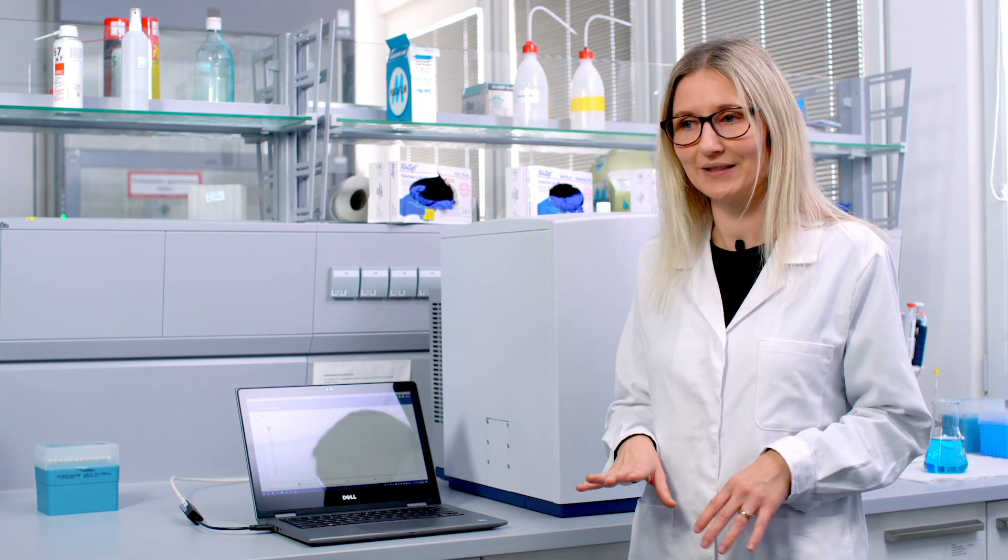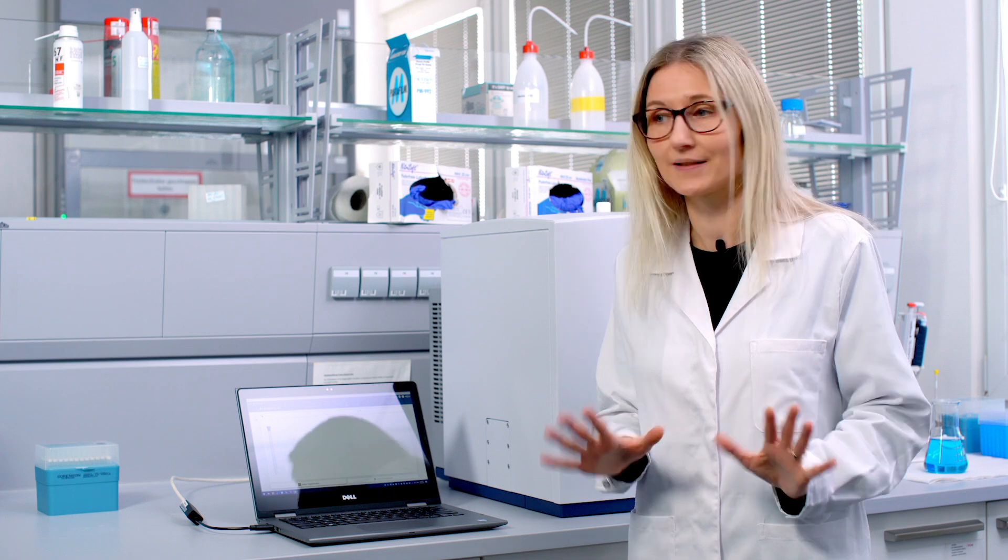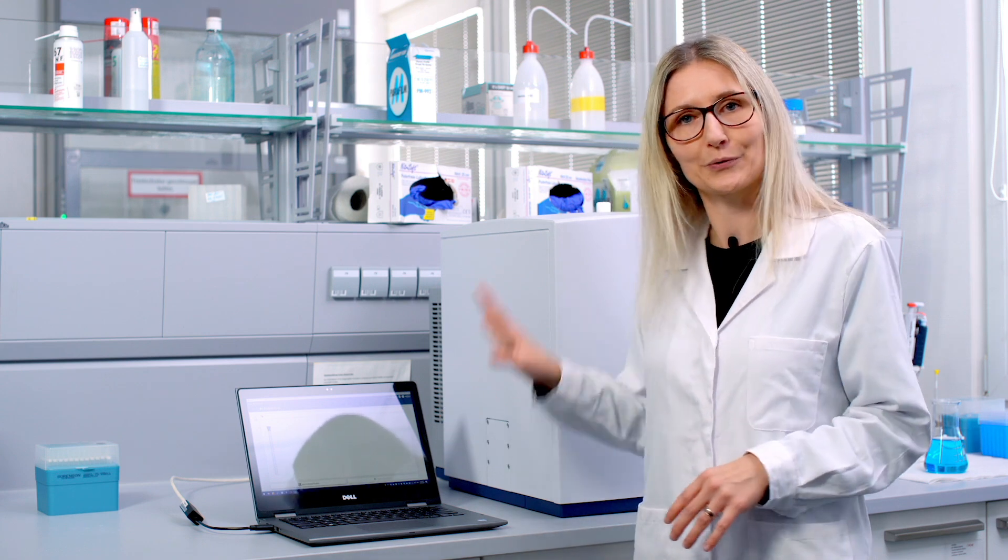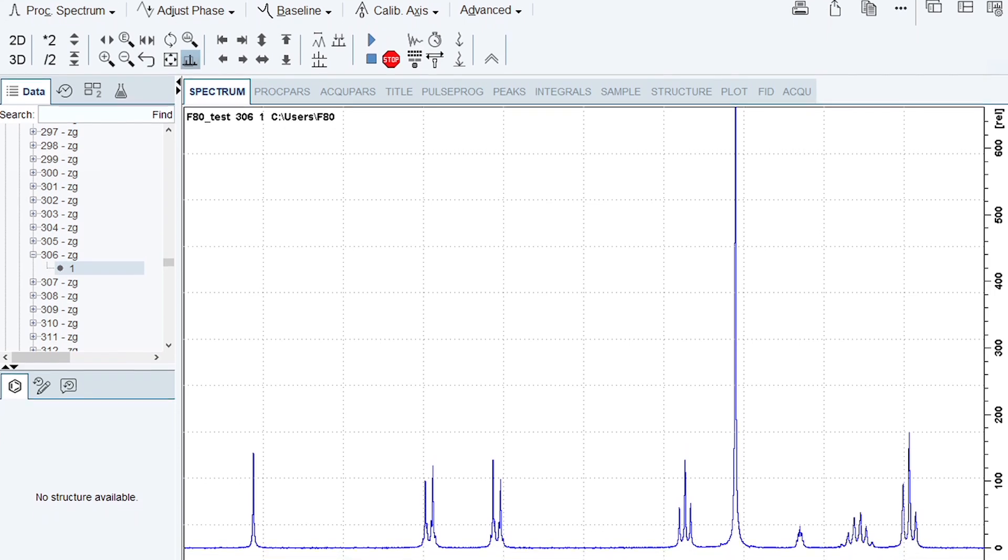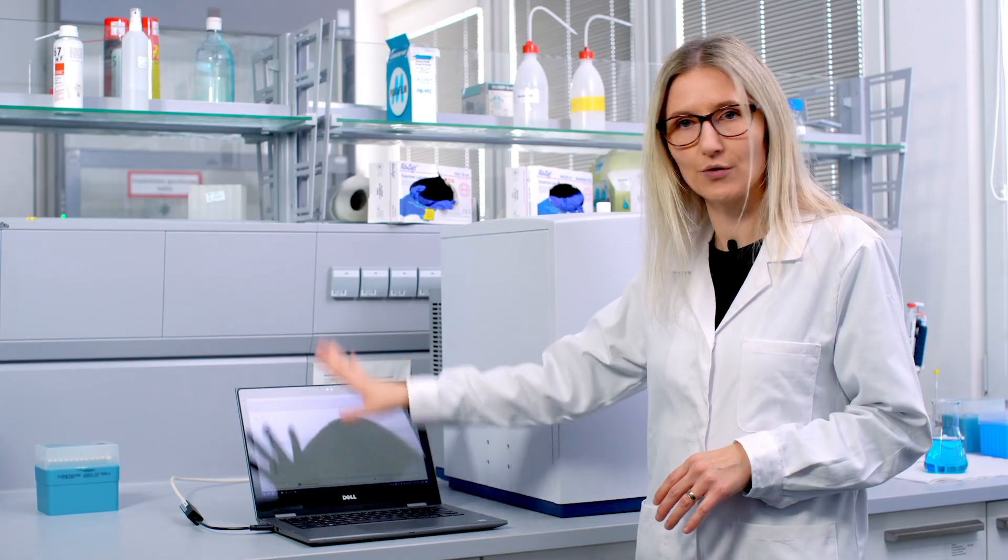If you want to get more flexibility and if you want to change parameters that's also fine because the Fourier 80 can also be operated with our industry leading software Topspin. So you can also operate it with Topspin. You open it on the same computer and you can set up your experiments to your needs.